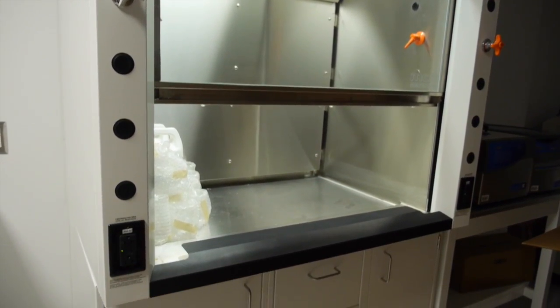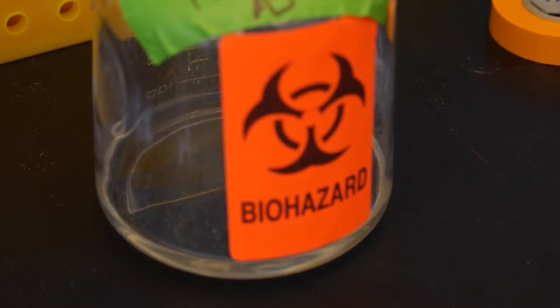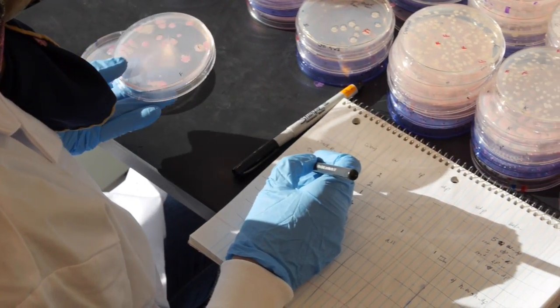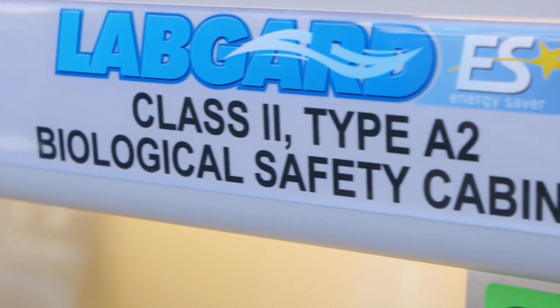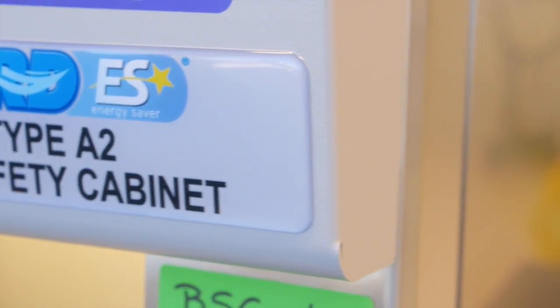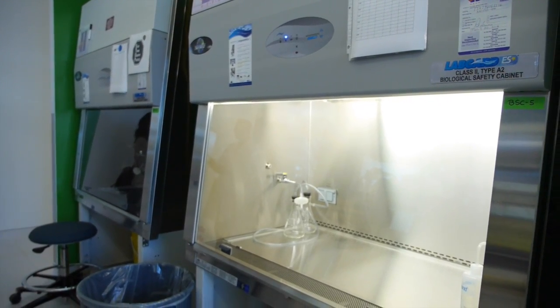If you're working with microorganisms, or materials contaminated with, or potentially contaminated with a pathogen, do not use a fume hood. A biological safety cabinet should be used instead, as they're designed to remove particulates versus vapors and aerosols.